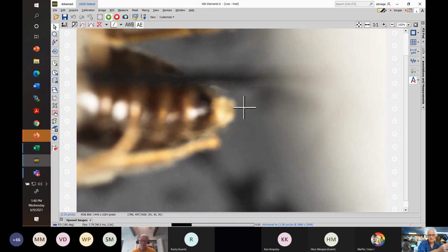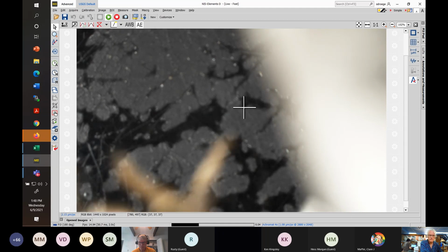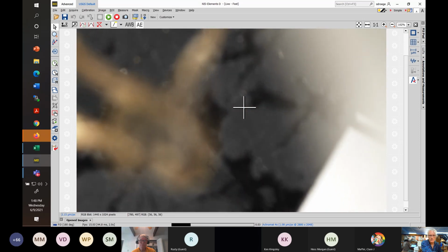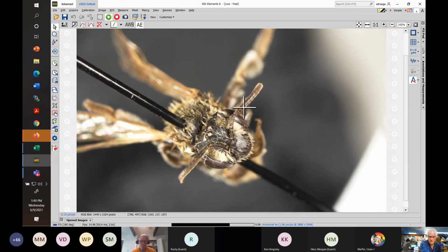So let's zoom back out and go to a specimen with a pronotal collar that is smooth, which would be our friend Nasonii, which is so common that I don't feel bad about snapping its head off. So, in general, males and females can have pronotal collars, but in males, the collars are often far more pronounced than the females. I have no idea why. And in a few cases, the collar almost entirely shows up in the male form, and the female has none. But most of the time, what a terrible looking specimen.